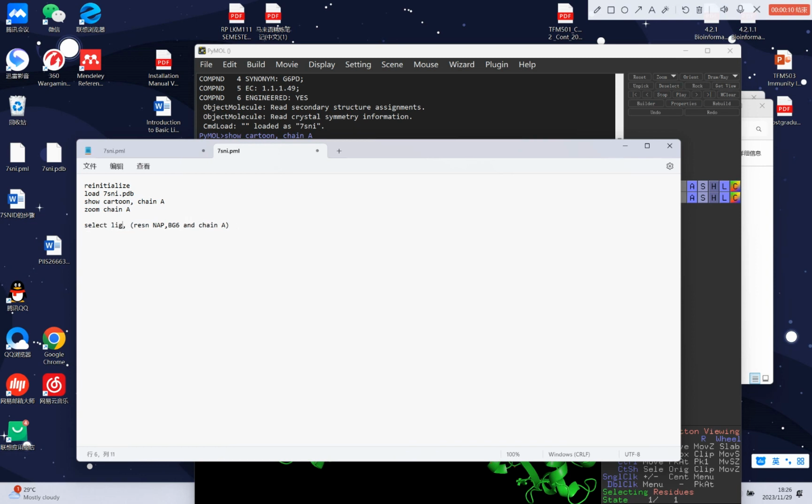Let's check first. This is for my Instagram one. Okay, good. So every time you want to run the same command, you just press the up arrow. So this time, show sticks. If I put this one, A side, I don't have to repeat every time. So I just use A side, show, and all the selection will be shown as sticks. Okay? Done? Yeah.